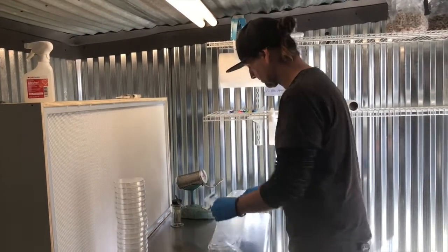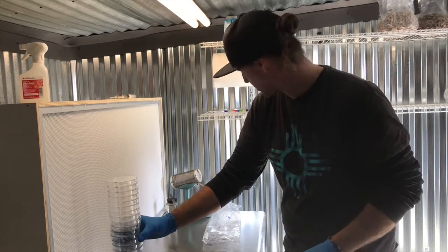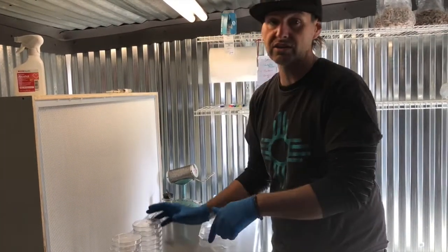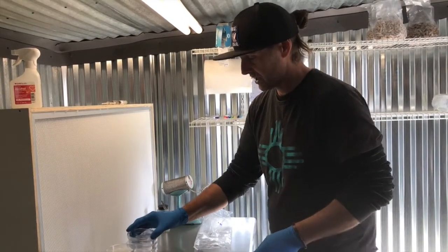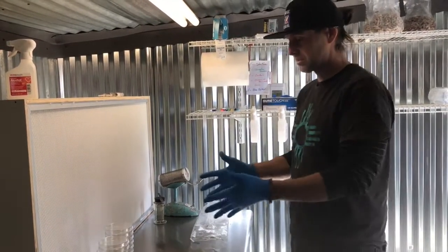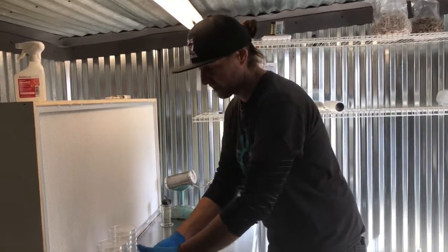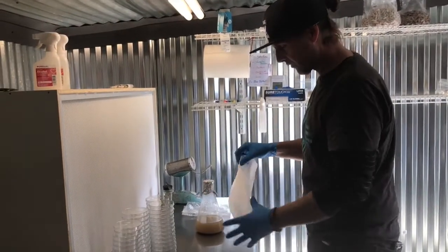That will be approximately 20 plates per flask. Each sleeve is either 20 or 25 plates — sometimes it varies. Anyway, the first step is to set all of our plates out in front of the flow hood or whatever aseptic environment you have. So you can see we have all of our plates laid out — this is two sleeves of plates.